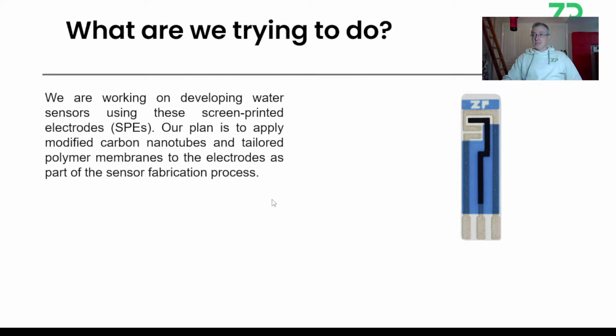It's appreciated. They will be modifying our screen printed electrode. Now this is important. If you're going to modify a ZP screen printed electrode, it's the modified electrode that you should be assessing. It's not actually assessing our screen printed electrode as it comes, because that's not the product that you're trying to make. So I will talk a lot now about how to measure and how to improve the stability or the experimental setup, let's say. But in the end, you'll see me finishing with, but it's actually not the screen printed electrode you should be testing. You should be modifying it and testing that.